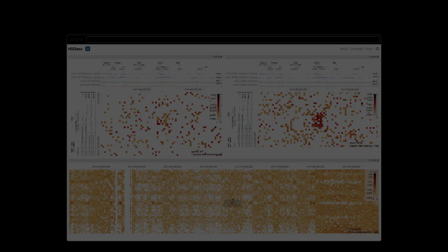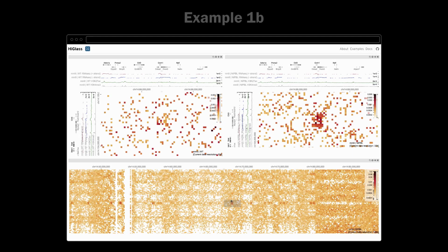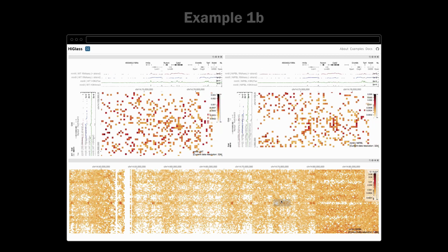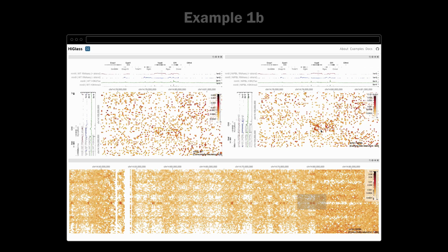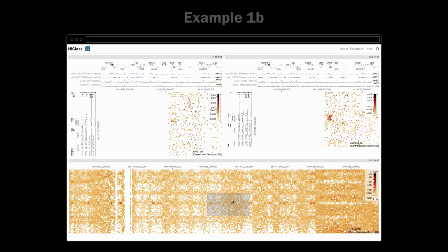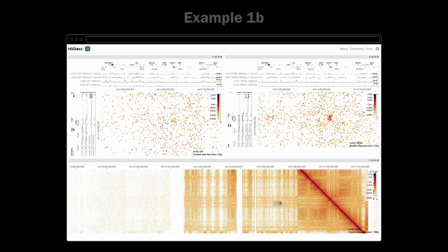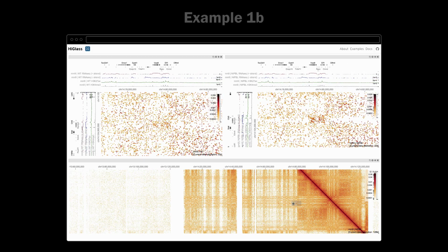And I'll just go back. All right, so we can show this again. When you're looking at the detail, here's the wild type. There is a little bit of that, but it's hardly present. And then let me see. There's another one. You see a little bit of structure here. When you zoom out further, you see that's a little bit denser there. And yeah, nobody could really explain to us what that is, but that's something we found by exploring the matrix, because these things are generally not there, and they have no particular meaning here. Okay, so that's another example.